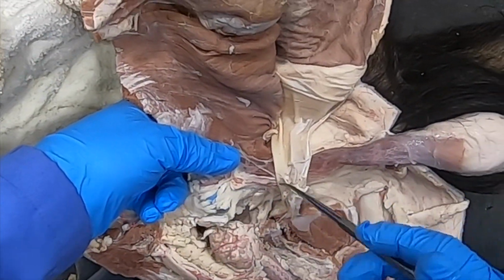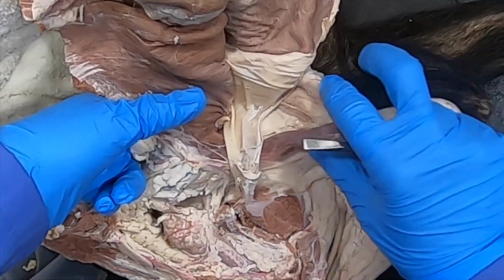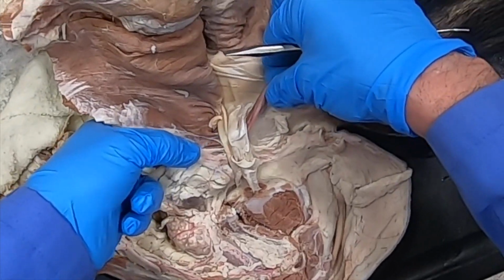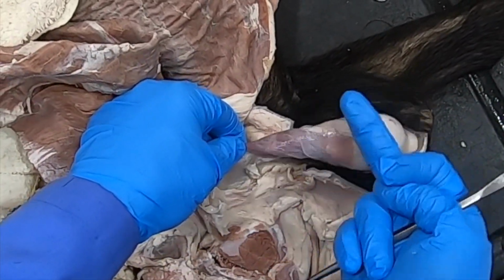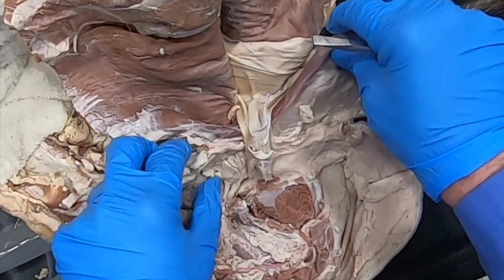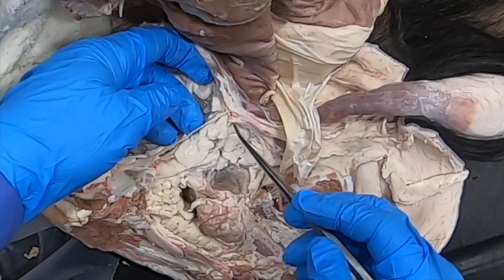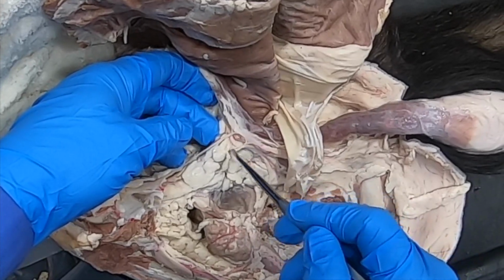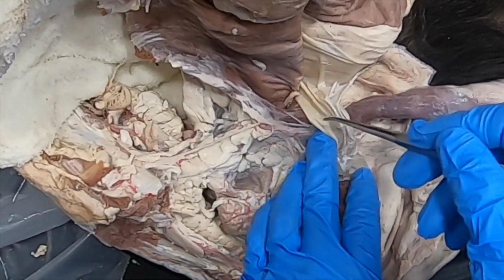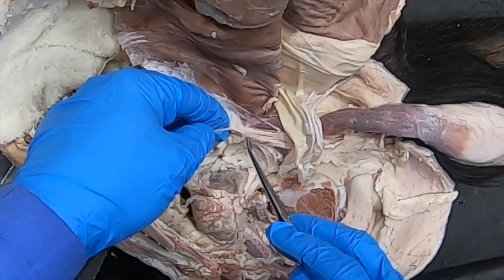So over on this side we can't actually see the spermatic cord, even though I kind of have it tucked on my fingers here. It's still within the parietal vaginal tunic down through here, but what we also see right here, so here's our external pudendal artery coming out, and this is our genitofemoral nerve.